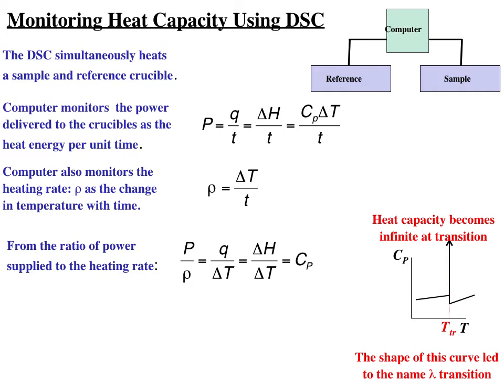Here I have a little cartoon of a schematic of the setup of a differential scanning calorimeter. What it contains is a pretty good heating element that can take materials from their solid metals and typical things, melt them all the way through their liquid transition points, which very frequently needs to be fairly high-powered heating elements to do such. Then what you do is you put your sample in a crucible, and you also put another empty crucible in the reference chamber, much like you might do in spectroscopy, kind of doing the same thing here.